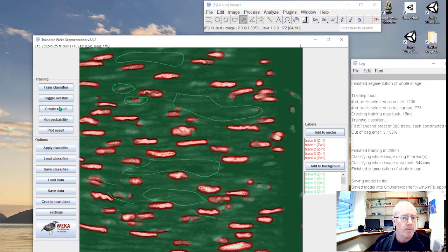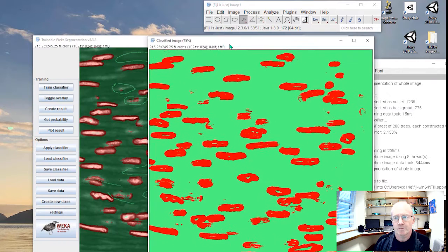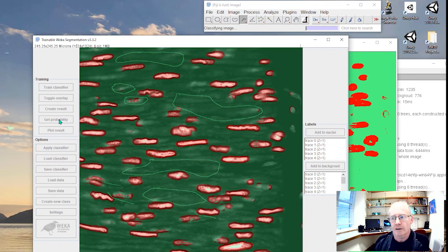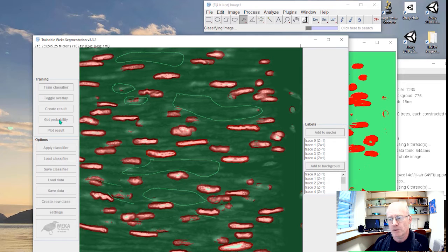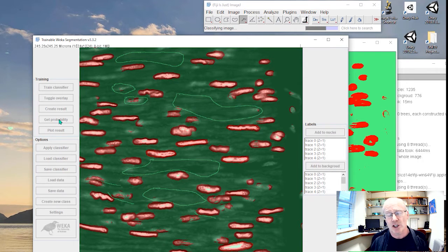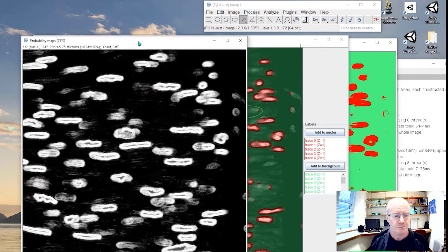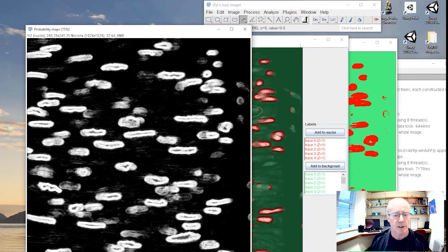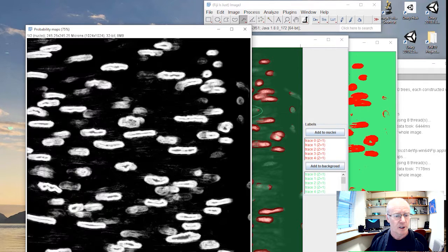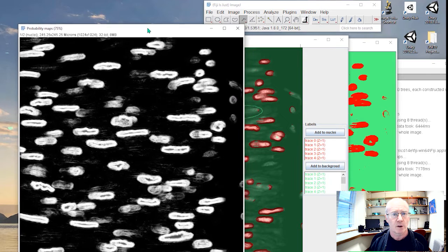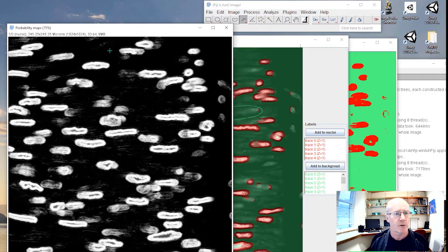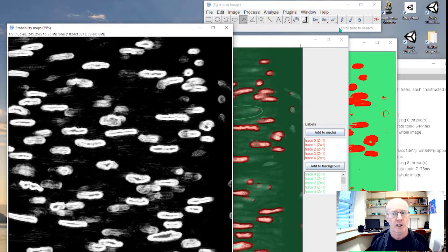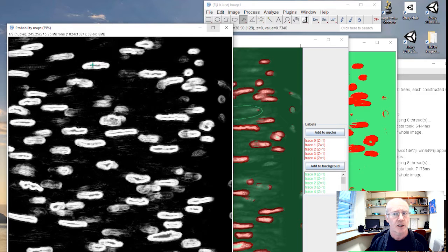Let's look at the result. So if we create a result, that's our segmented result. If we create a probability image, what it will show us, it will give us an indication of how well it thinks it's performed. There are two channels here, one for the nuclei, one for the background. If you run the mouse over the probability image for the nuclei, you'll see that when it hits a nucleus, if you look at the values up here, the probability of one means it's pretty certain it's a nucleus.